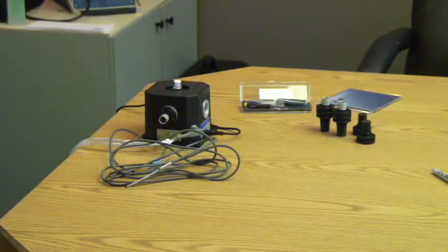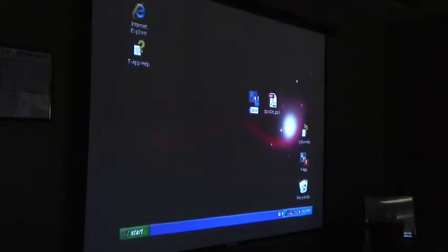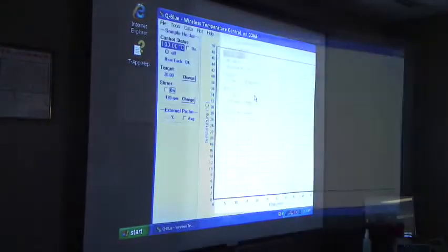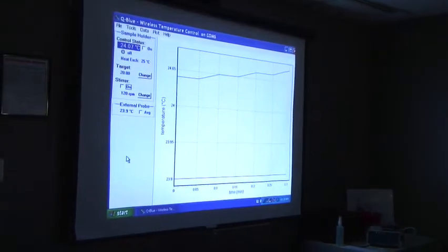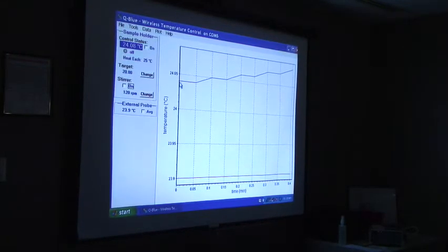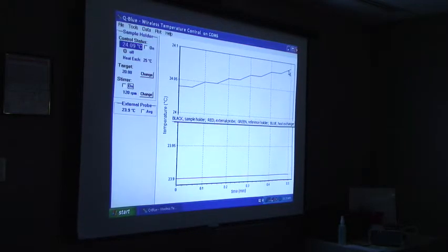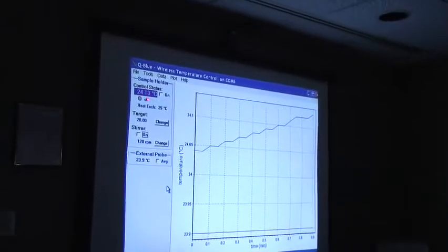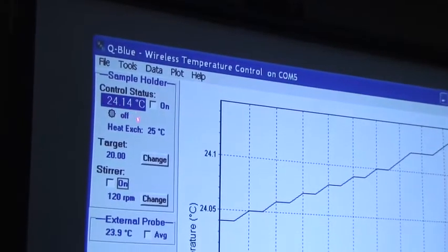Now I'm going to show you my computer screen. The unit went out and it found the Bluetooth connection, and it's now connected with the Q-Pod. What you see here is the program Q-Blue running. Notice the temperature of the cuvette holder is now drifting up very slowly — it's 24.1 degrees and drifting up.